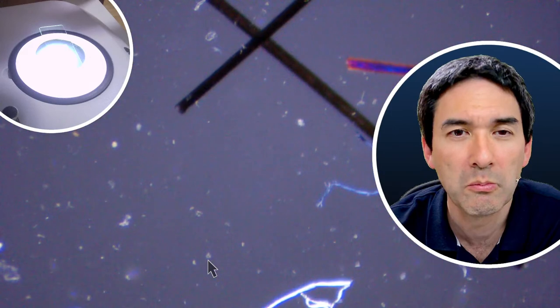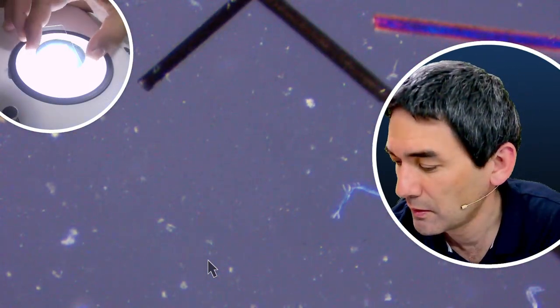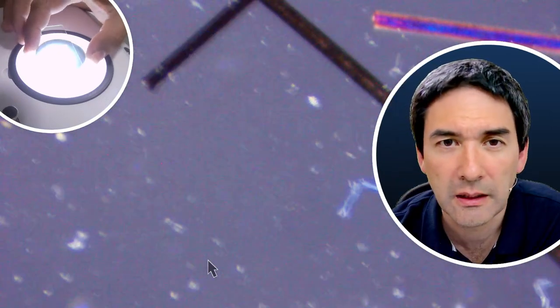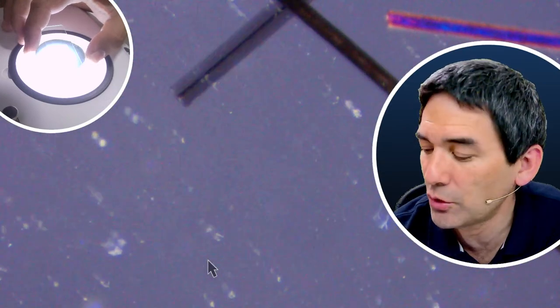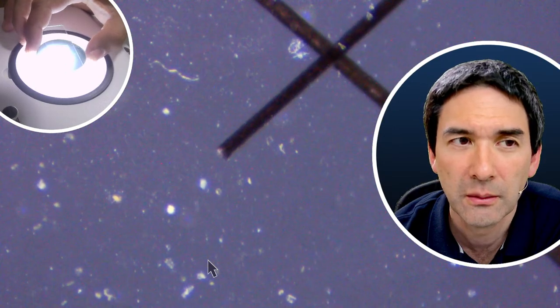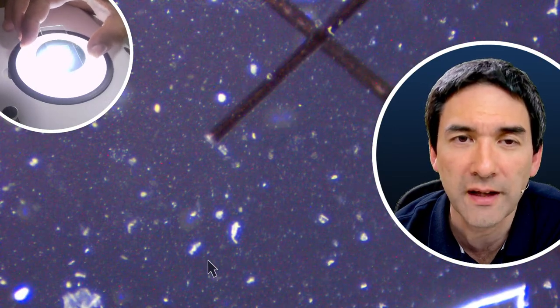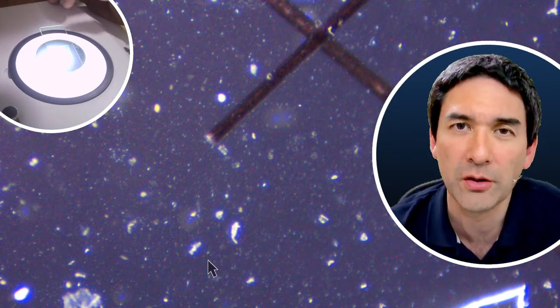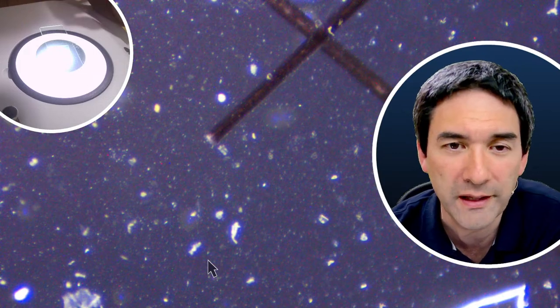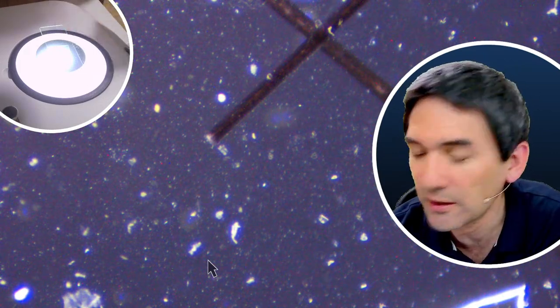Let's go in. Yeah, the camera sees the image is too dark and starts to overexpose. Okay, I guess it's a question of fine tuning, and because my hair is relatively dark anyway, you don't see a strong effect. But what you see quite nicely is all of the dust and the dirt, which becomes visible this way.